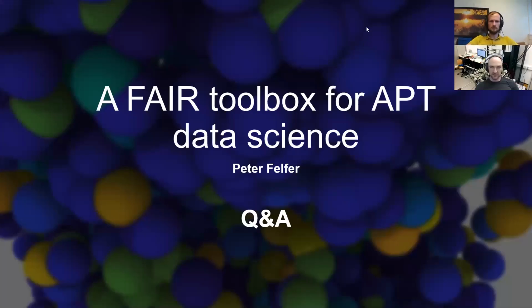That's great. Thank you very much. The point is, this code is not meant to be a feel-happy graphical user interface. It's meant for people to be able to do analysis on a lot of data in a short amount of time. Again, we want to see not analysis on one data set or two data sets. We want to see analysis on 1,000 data sets so that we can see trends. You know, what does the background in Atom Probe look like depending on the pressure in the measurement chamber? Things like that. But also all your standard analysis is included as well. This is 10 years of me coding that's included in there.